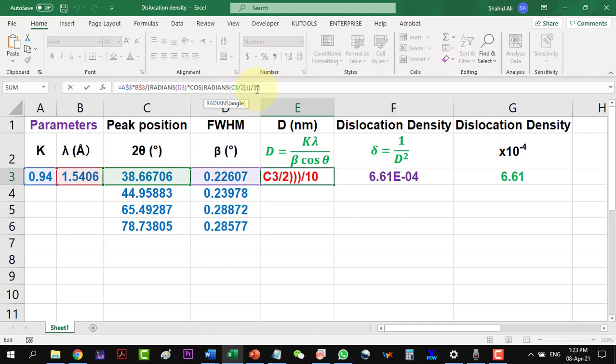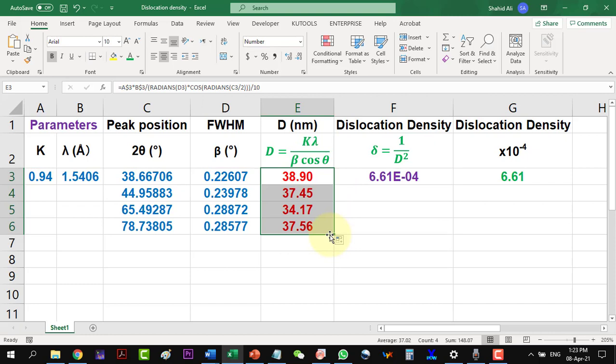The whole result is divided by 10, to get the value in nanometer, as we have lambda in angstrom. Let us drag for the other values of the crystallite sizes for all the peaks.